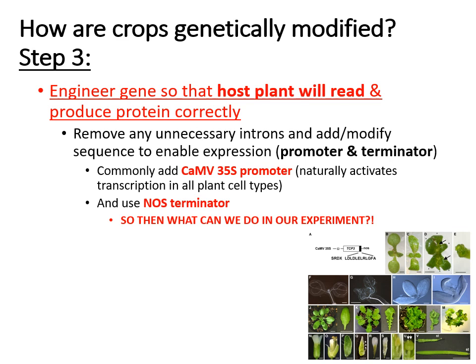And if a plant or a food product that comes from a plant has either of these sequences, which are not naturally found in plants. Notice both of them are from organisms that infect plants, but are not plants themselves. One is from a virus and one's from a bacteria. So these sequences are not naturally found in plants.